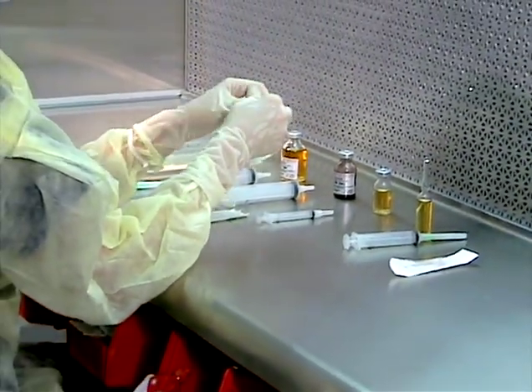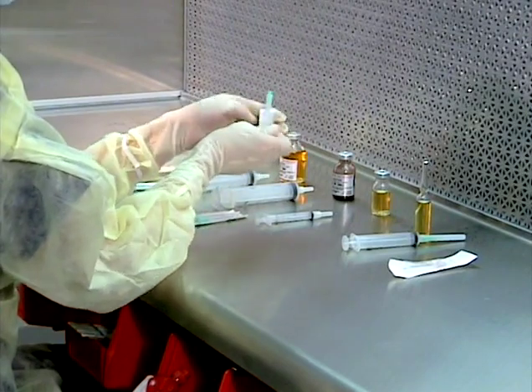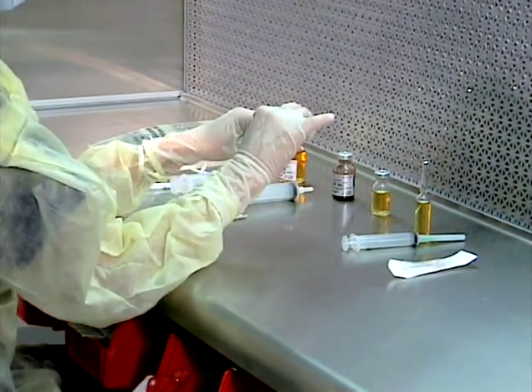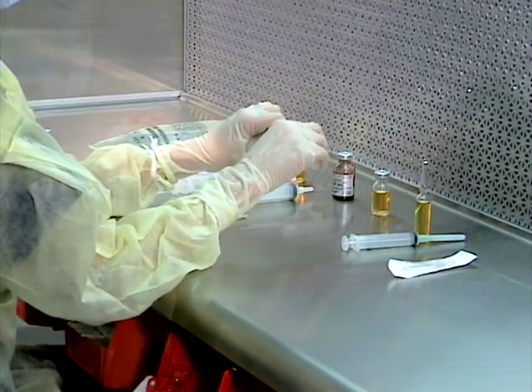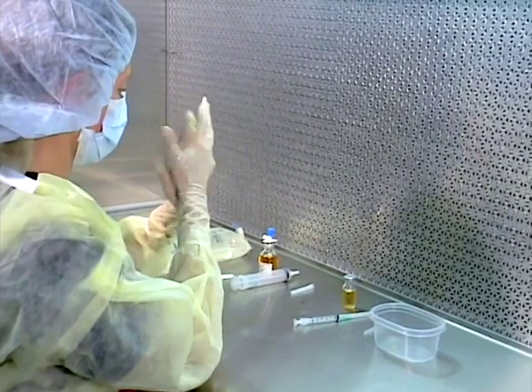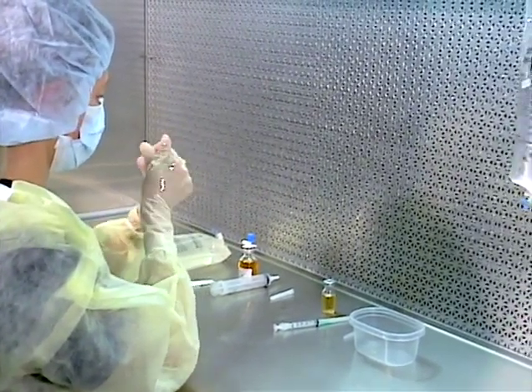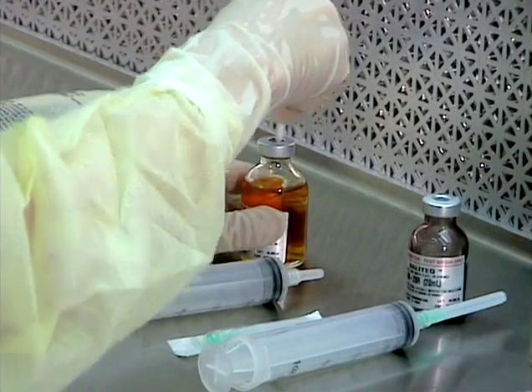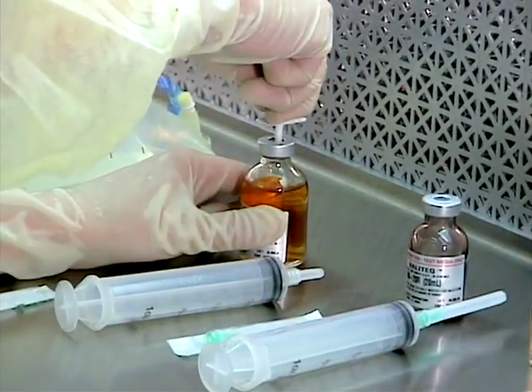Remove all wrappers not required for sterility and place all working materials in the hood near the staged vials and final containers. Disinfect gloves and allow them to dry in the laminar airstream. Commence compounding operations following drying of the alcohol.